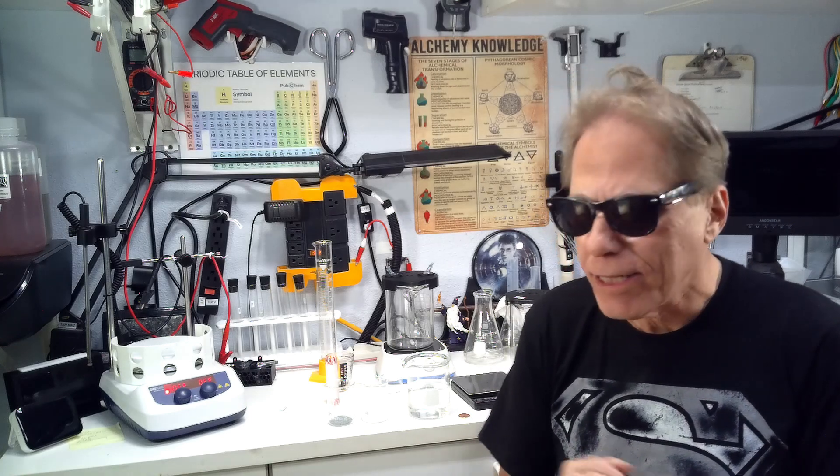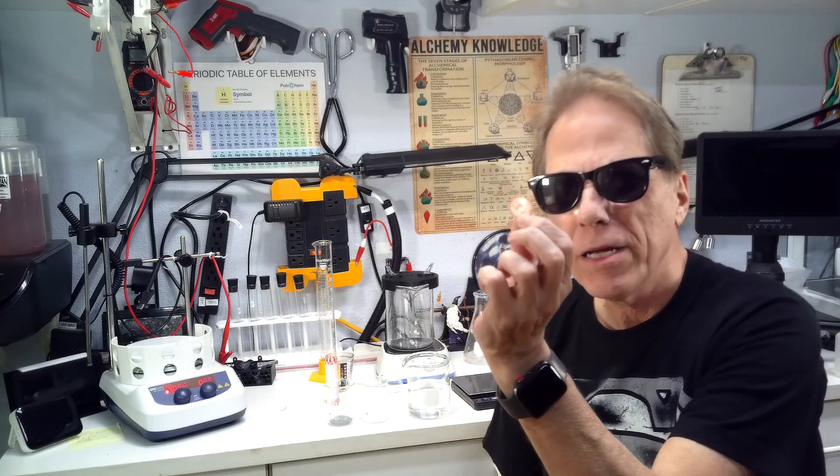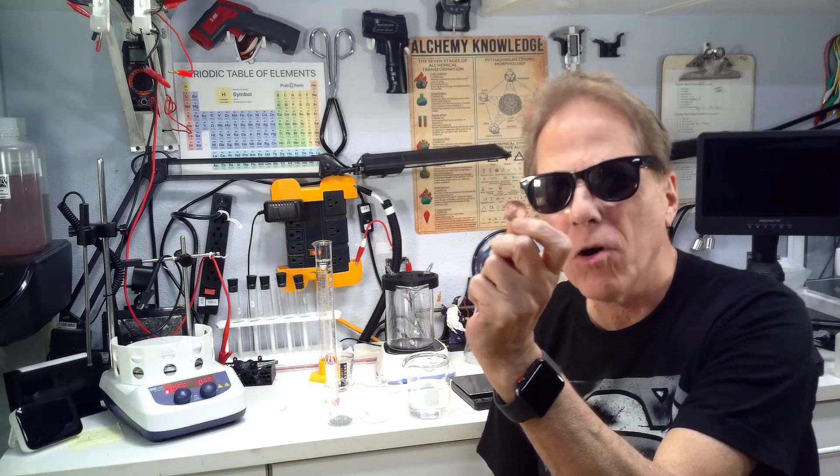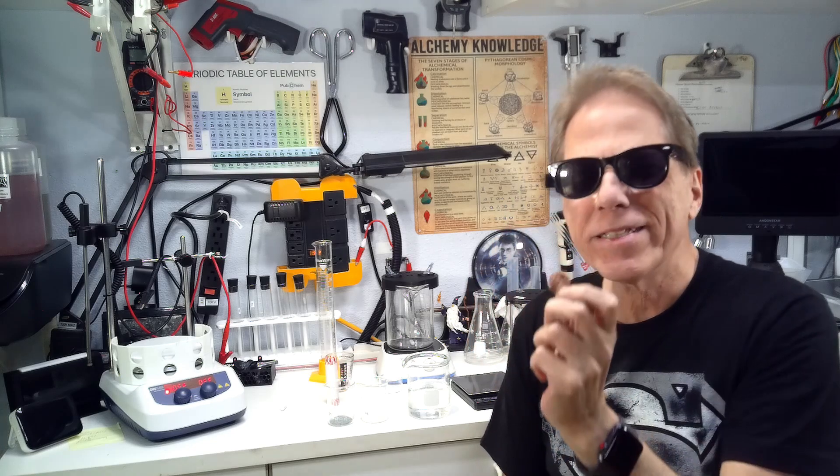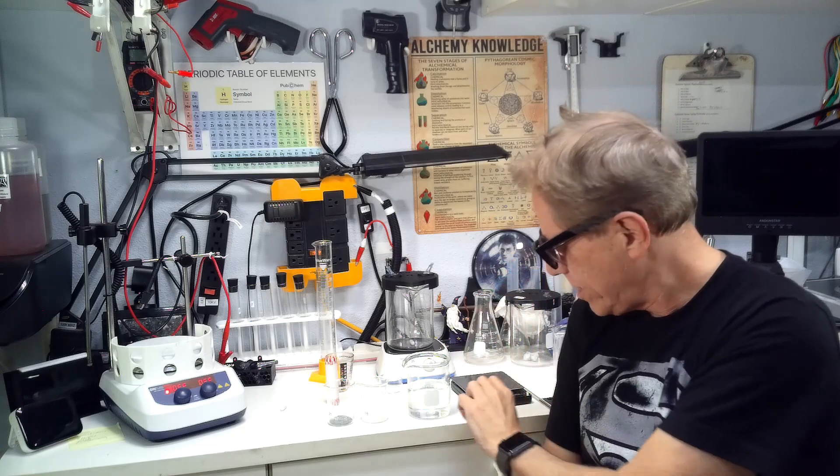Welcome to Alchemy Wizard. I'm Tom. Today we're going to take an ordinary copper penny and turn it into a gold penny. This is alchemy at its best, changing one thing into another. So let's get started.